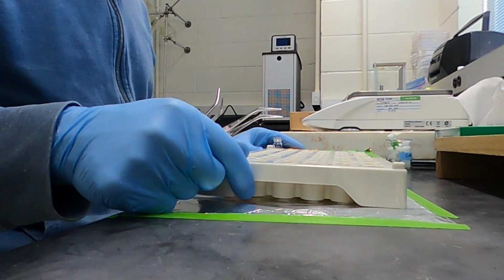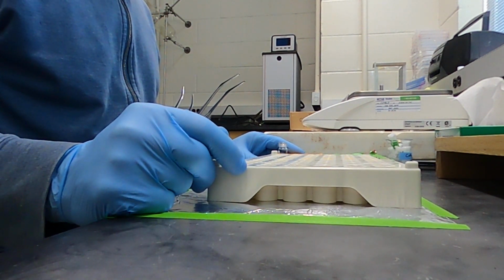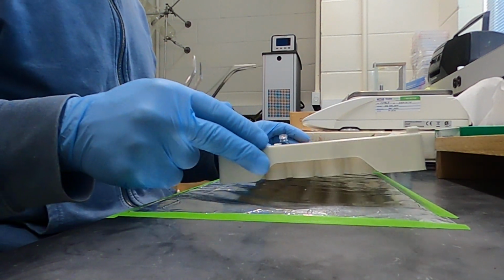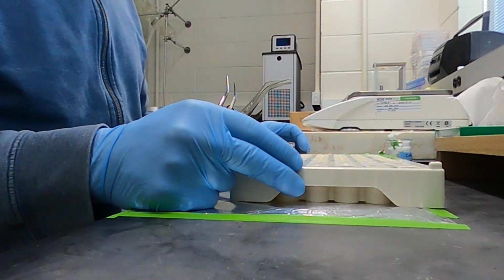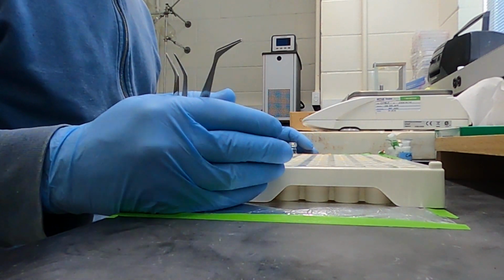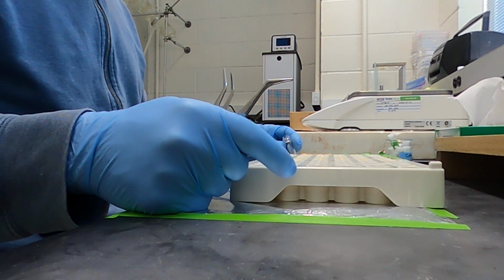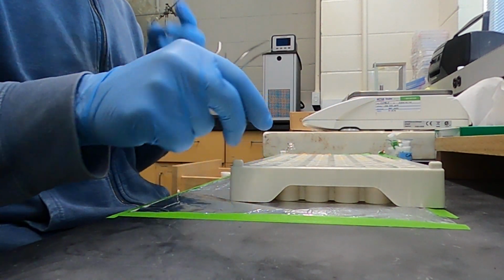So the first thing to do is to weigh out standards, because when we do stable isotope studies, well, everything is measured against the values returned by given standards. So we're gonna get ready a tray with 3 standards actually, regularly placed on that tray.